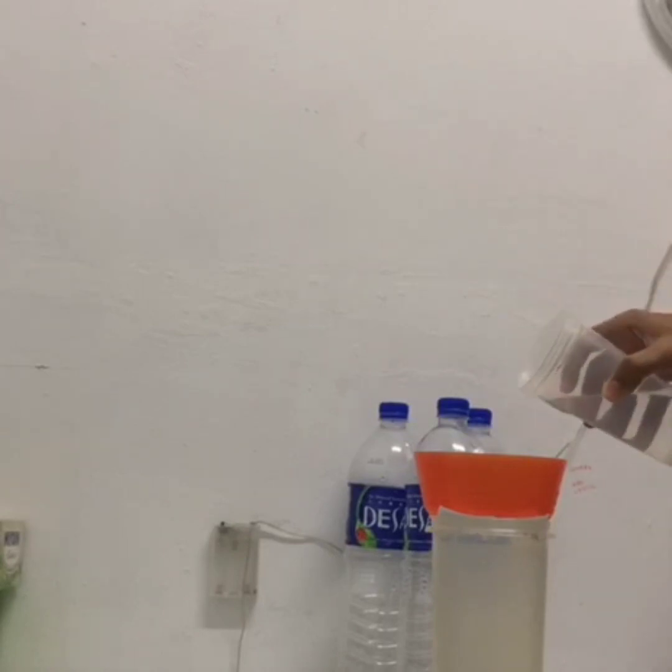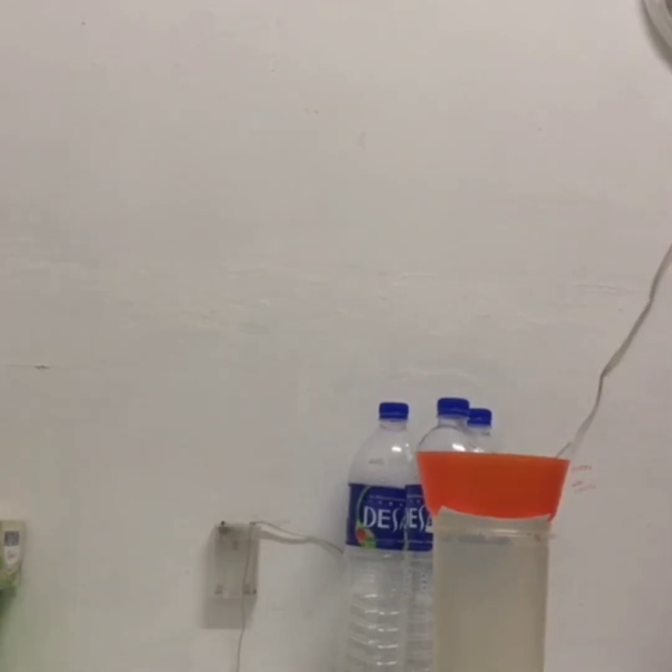Turn on the pump and then pour the sample into the filter holder. Repeat the rinsing of both the graduated cylinder and funnel with distilled water 3 times.